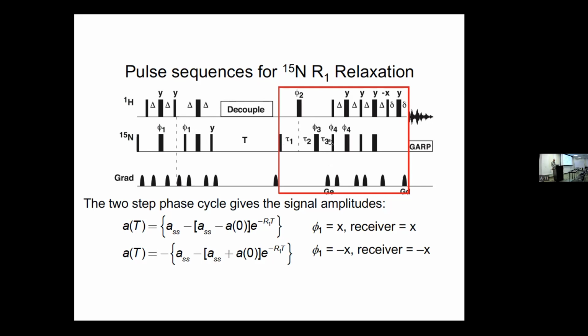But that means here, right before this, we have antiphase, say 2IZSX, that's cosine modulated with the chemical shift, and 2IZSY, that's sine modulated with the chemical shift. And this latter sequence has two INEPTs to refocus both of those. So we refocus one of them while storing the other as multiple quantum, then store the first as Z magnetization while we refocus the second.